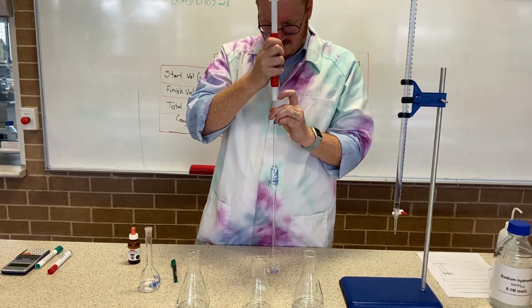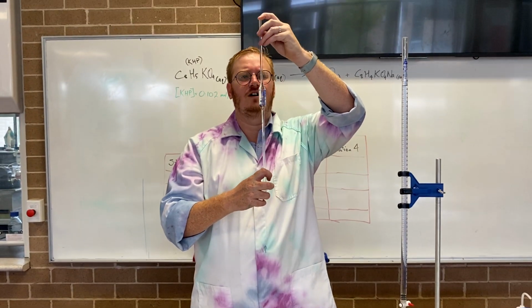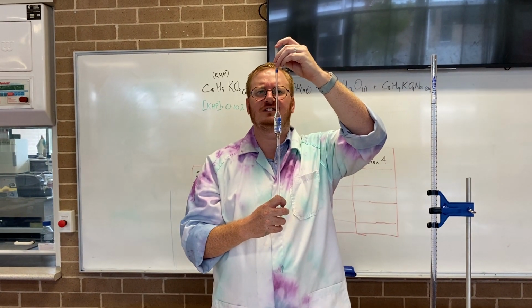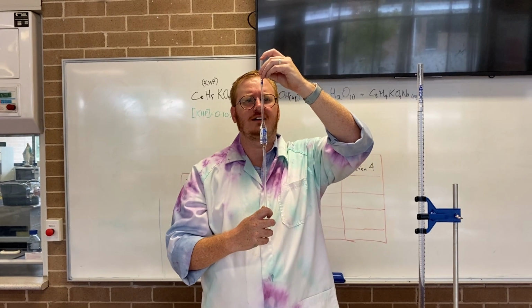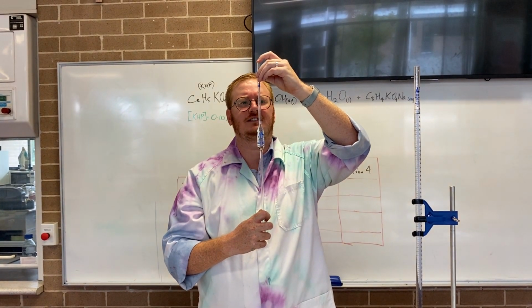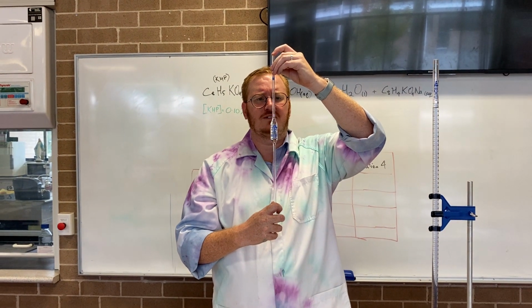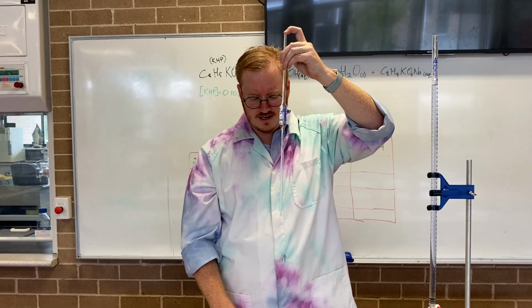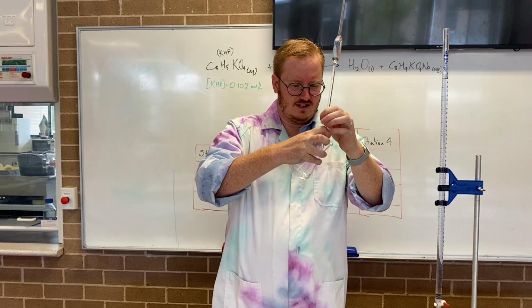So I brought it way up there, get my finger on it, up to eye level. Don't ever kneel down to look. You don't know what's on the lab floor. There could be broken glass, there could be anything that you're putting your knees on, not very safe. You're also putting your head right at bench level, ready for stuff to spill right in your face. Not a good idea. There's 25 mil. Leaving it to drain.